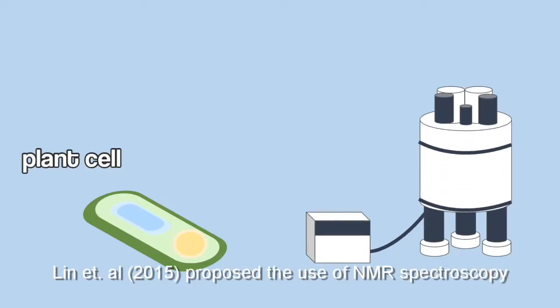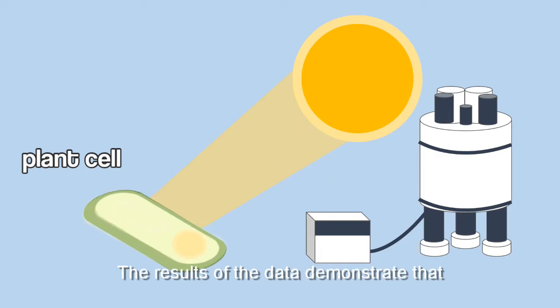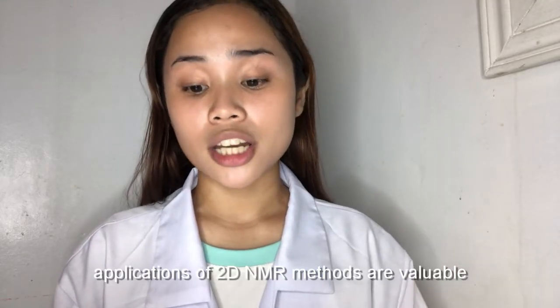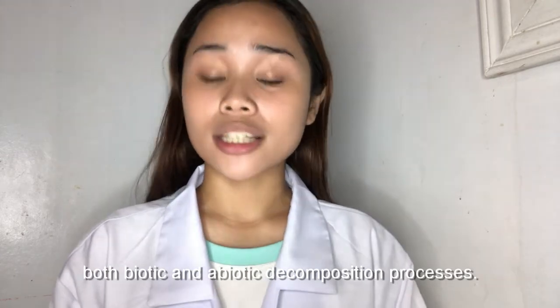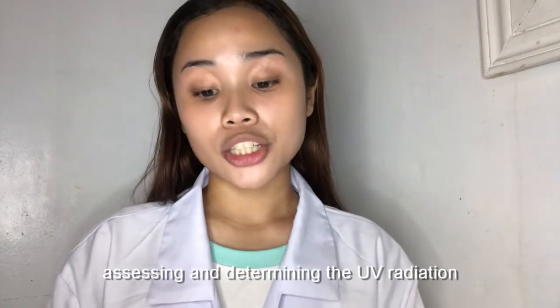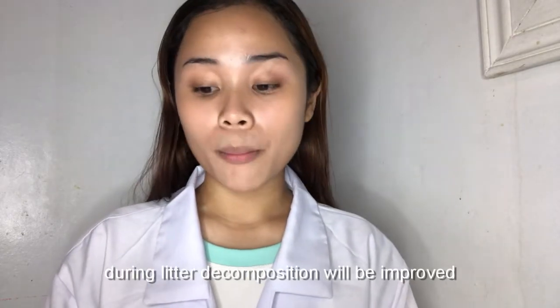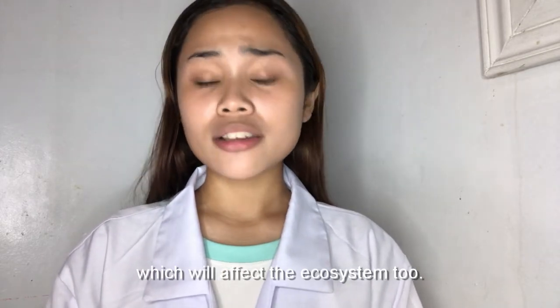Lin et al. 2015 proposed the use of NMR spectroscopy to assess UV radiation during litter decomposition. The results of the data demonstrate that applications of 2D NMR methods are valuable for acquiring detailed information during both biotic and abiotic decomposition processes. Through the use of NMR spectroscopy, assessing and determining the UV radiation during litter decomposition will be improved in the agriculture of the country, which will affect the ecosystem too.